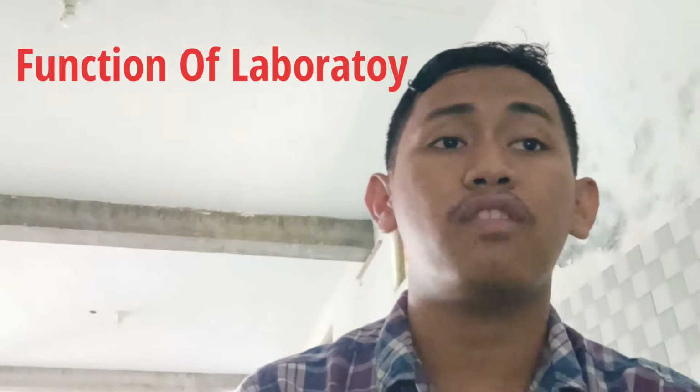A laboratory is a place where people carry out various kinds of research activities, observation, training, and scientific testing, approaching theory and practice of various knowledge. The functions of a laboratory are: 1.